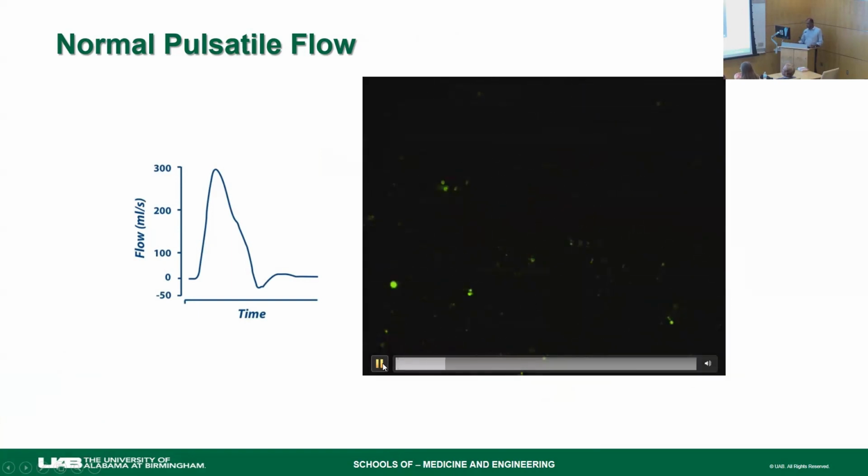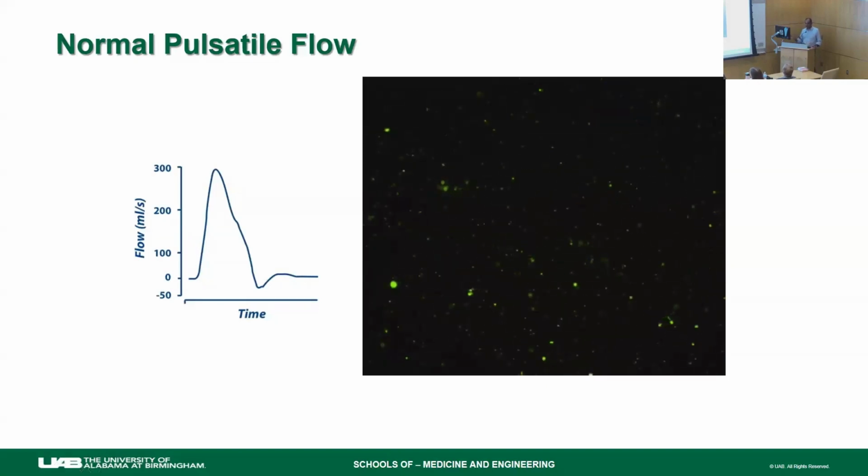So these beads are just helping you visualize what the flow looks like. The particular thing I want you to pay attention to is there's acceleration in the flow and then it decelerates and stops. But before it stops, you see this little point where the beads oscillate. So that's mimicking what happens when the aortic valve shuts and the flow bounces back off a bit.